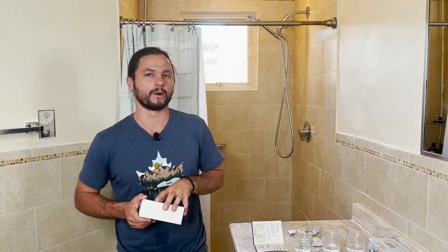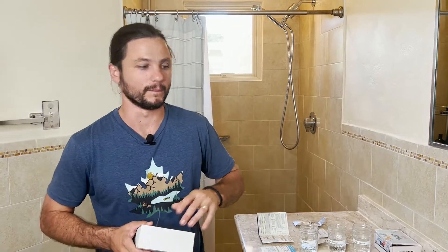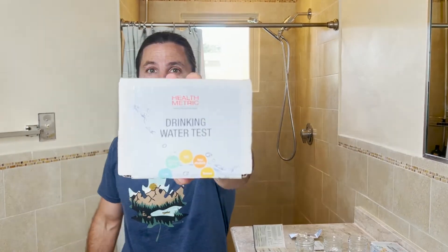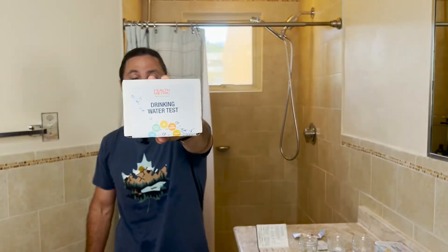Hi, this is Justin Ball, the owner of The Showerhead Store. In this video, we're going to test the water from our tap, this Sprite showerhead filter, and a Crystal Quest showerhead filter in the other shower. We're going to test for chlorine and lead using this HealthMetric at-home testing kit.